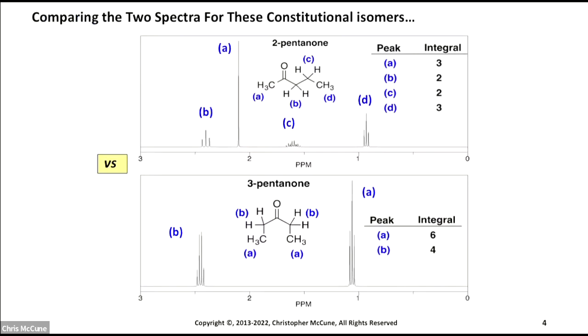Here is the NMR for each of the two structures we were looking at. So you can see once again, you've got 4 signals here, right? And you've got only 2 signals here. And so the integral here would be 3 hydrogens. You would see 3, right? The area under the curve is 3, and C, that area is 2, and A, that area is 3, and for B, the area is 2. And so those are the integrals that you would see if the NMR was integrated for you.